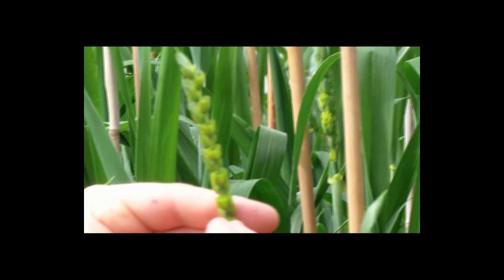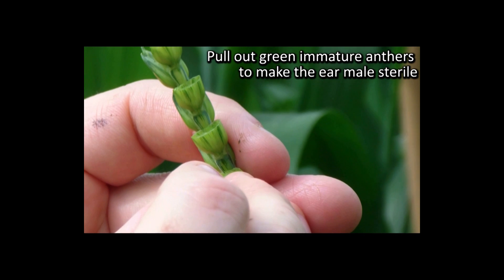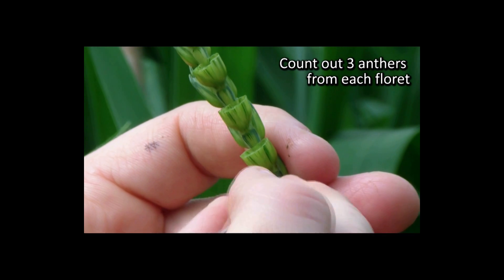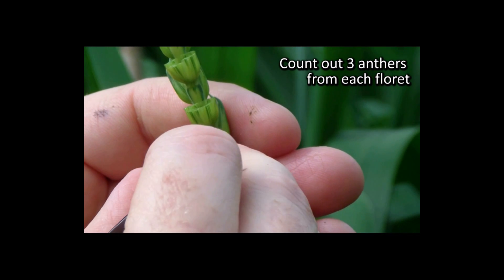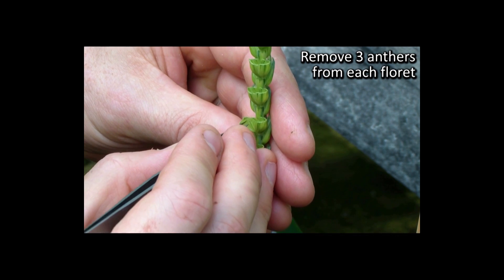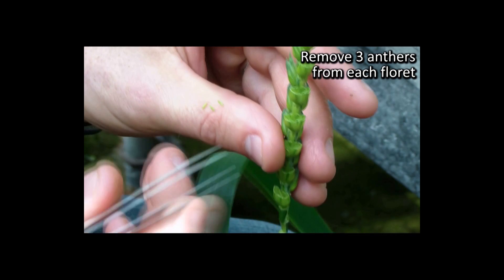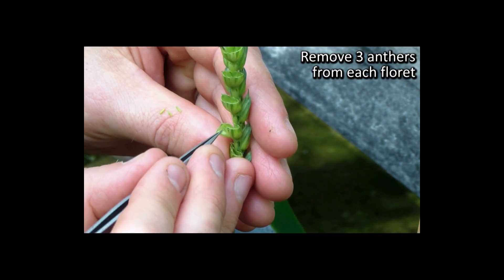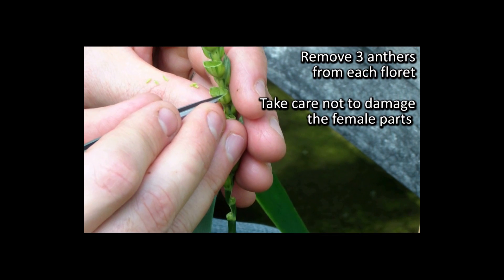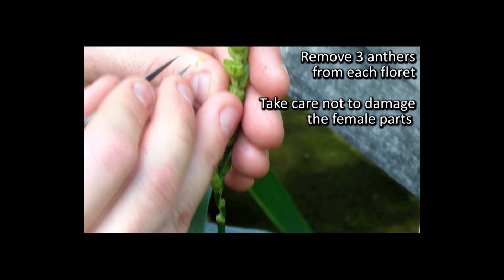What we're doing now is pulling out green immature anthers which will make this ear male sterile. The important thing is to count out three anthers for each floret. What we're attempting here is to remove three anthers from the florets — whole anthers — trying to pull those out without damaging the female parts as we remove the male.